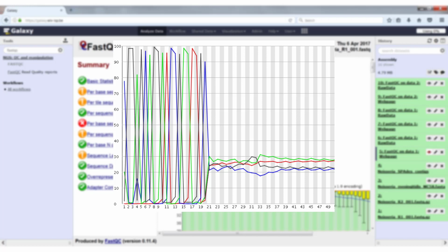Illumina uses the first cycles of a sequencing run to determine the clusters. When all clusters have the same composition in the first bases, some clusters might be merged based on these sequences. When the sequences start to diverge later on, the sequencer will have problems identifying the correct bases in these merged clusters and therefore result in lower quality calls.